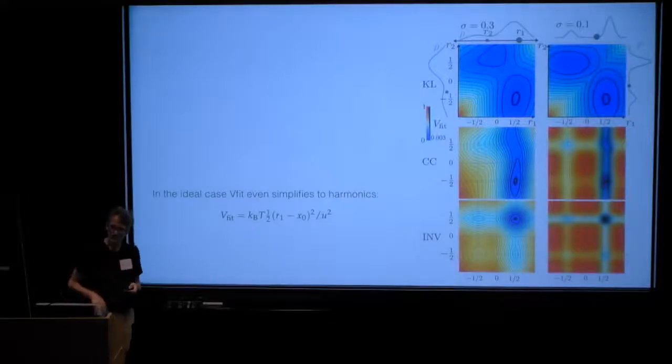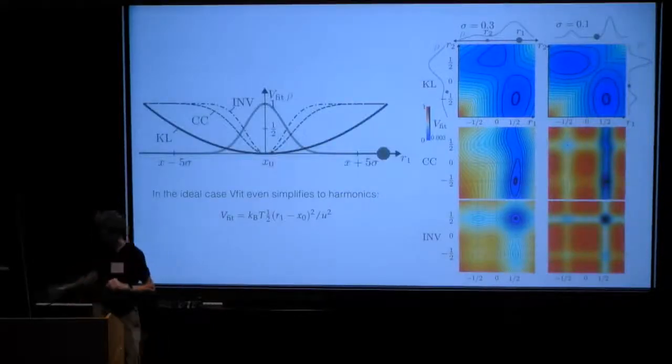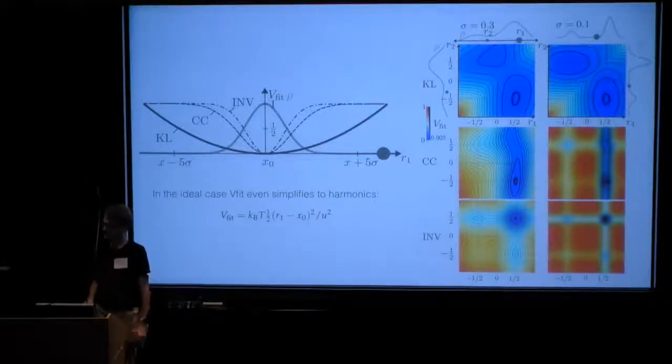And here's where things start to look pretty nice. As I mentioned, there are a few different ways to do this in the literature. The traditional, super easy way that MDFF pioneered is that if we have electron density, let's just invert the electron density, use that as potential, and drag the electrons there. And that would be that part.